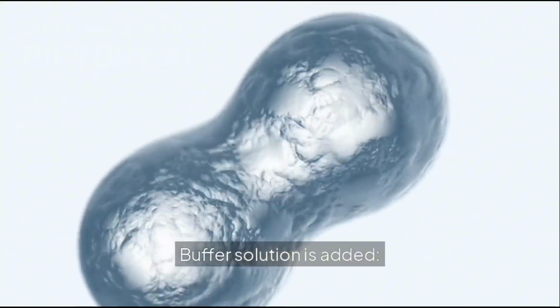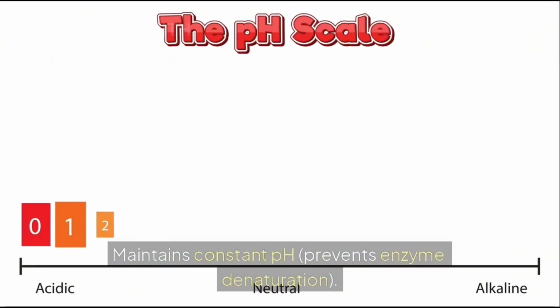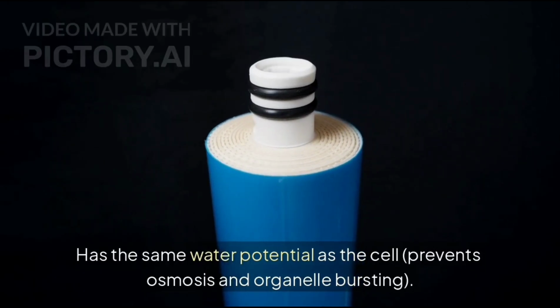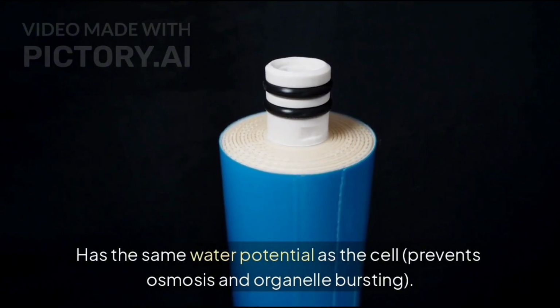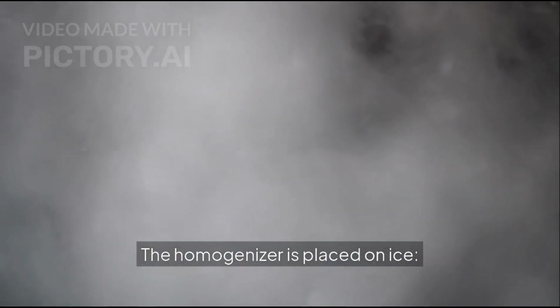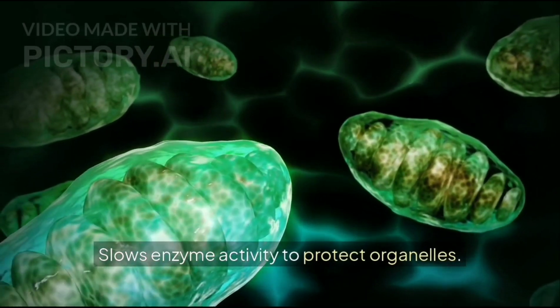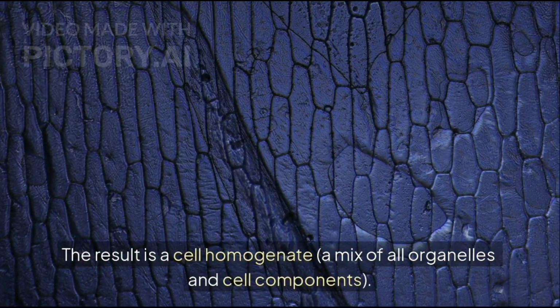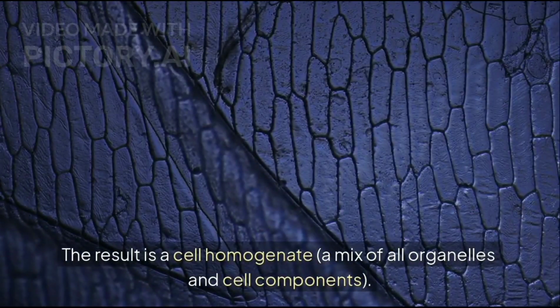Next, the buffer solution is added. This helps maintain a constant pH, which prevents the enzymes from denaturation. It also has the same water potential as the cell, which prevents osmosis and organelles from bursting. The homogenizer is then placed on ice. This slows enzyme activity to protect cell organelles. The result is a cell homogenate, a mixture of all organelles and cell components.